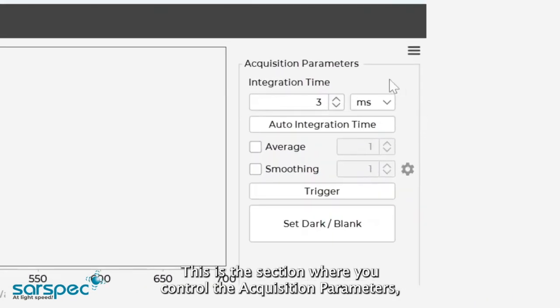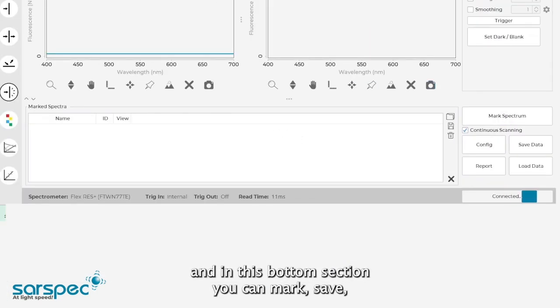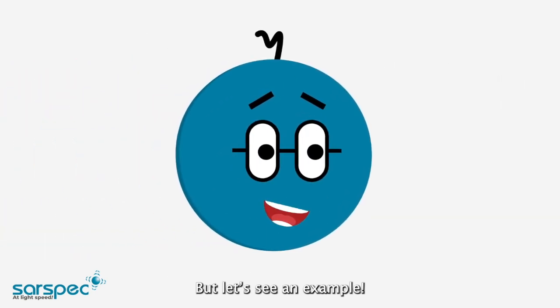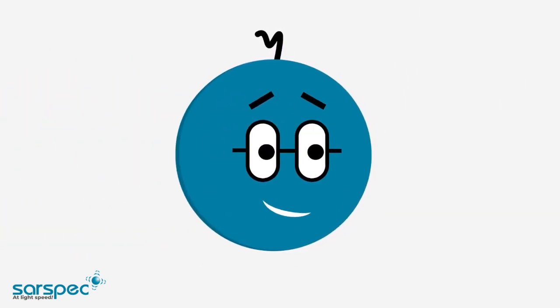This is the section where you control the acquisition parameters. And in this bottom section, you can mark, save, and load single and multiple spectra. But let's see an example. It's very important to select the correct excitation wavelength.